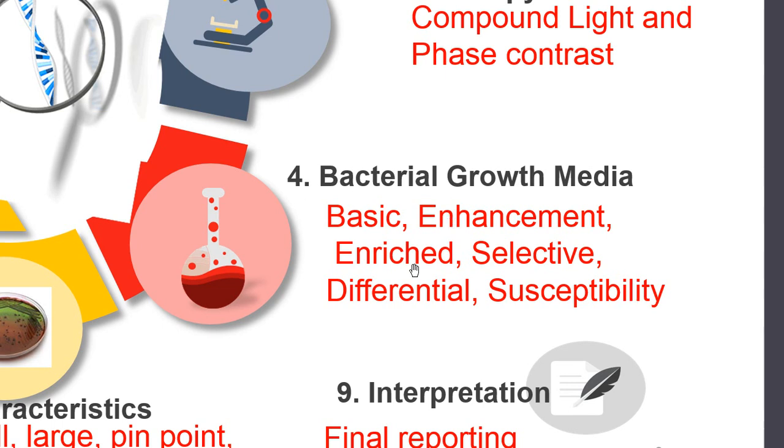And finally, after getting this basic idea about the type of organism on the basis of their growth on different types of media, we will go for the antibacterial and antimicrobial susceptibility of those microorganisms on the specific susceptibility media. Normally the susceptibility media that we commonly use includes Mueller-Hinton agar, and we use different methods.